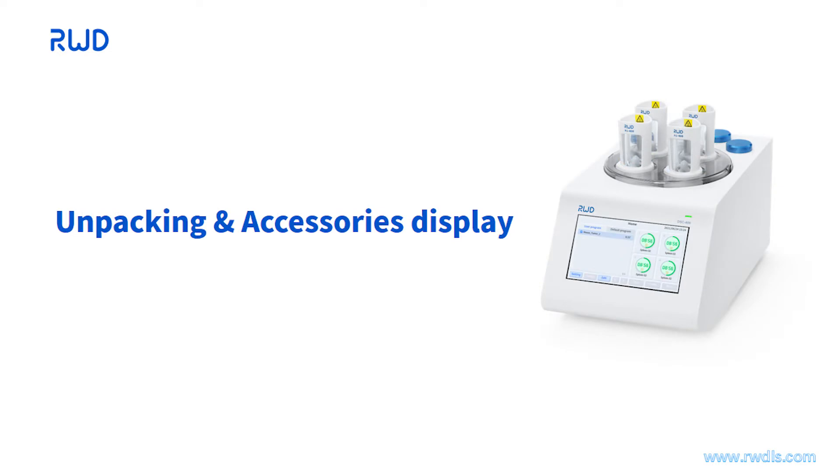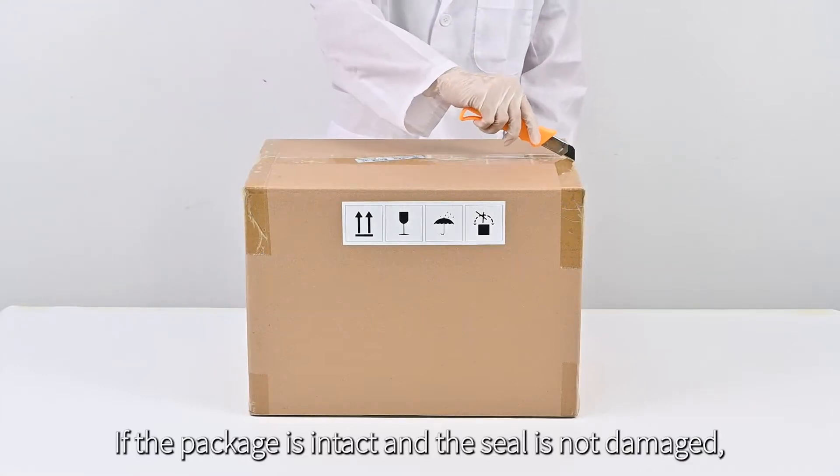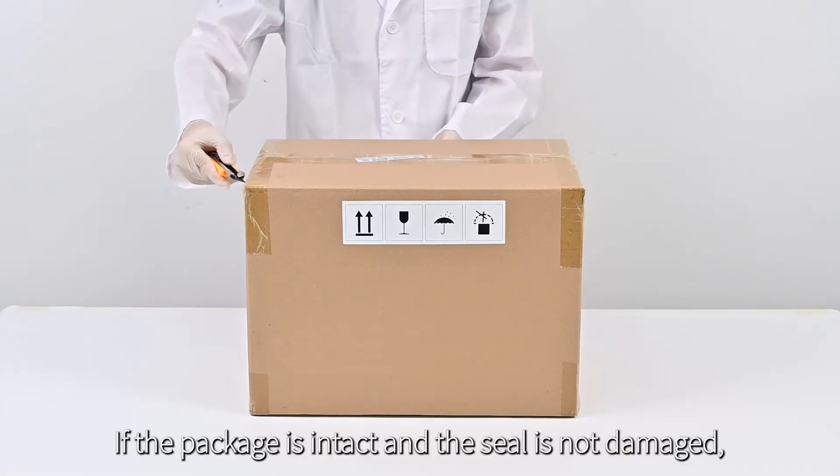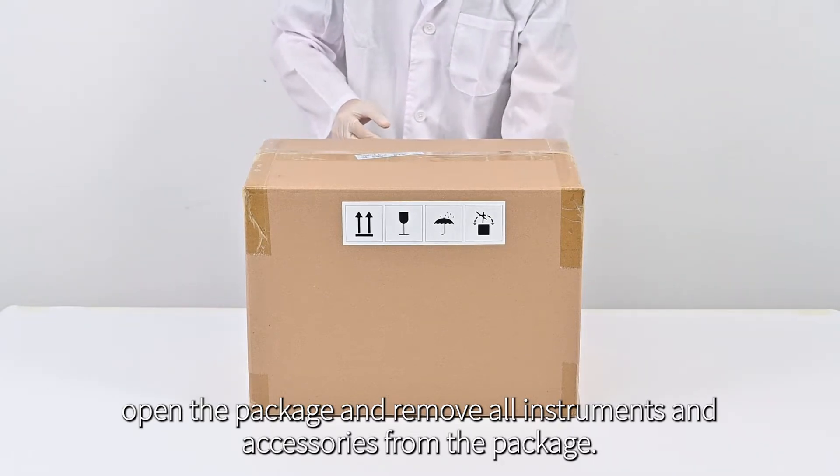Unpacking Accessories Display. Before unpacking, carefully check the outer packaging, and contact the vendor if the seal is broken or the box is damaged. If the package is intact and the seal is not damaged, open the package and remove all instruments and accessories.